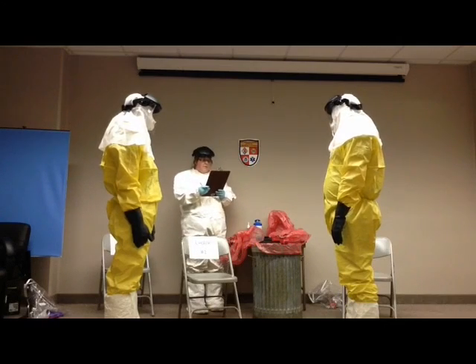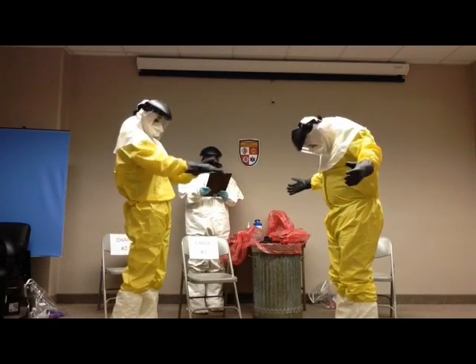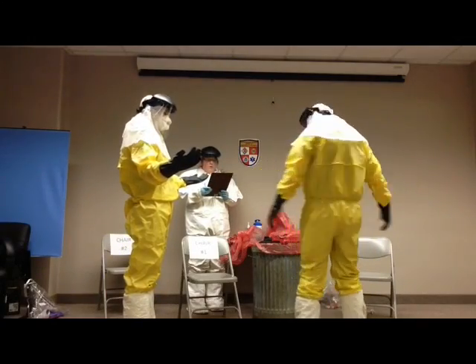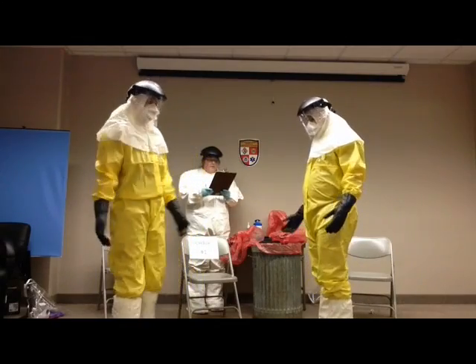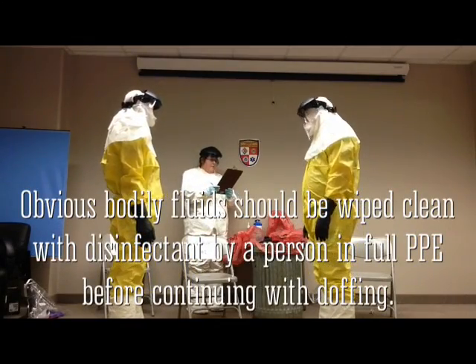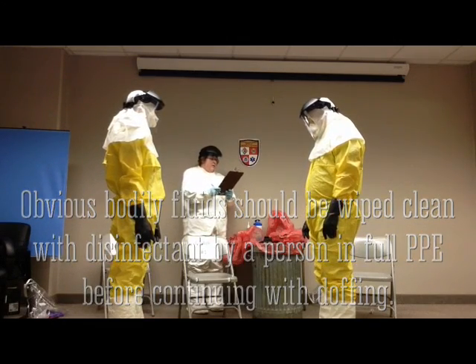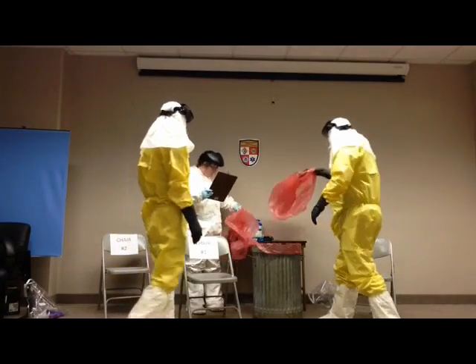Inspect PPE to assess for visible contamination, cuts or tears. Consider disinfecting the entire coverall with disinfectant wipe or spray, regardless of visible contamination. If there is visible contamination, then disinfect using the disinfectant wipe or spray. Allow for proper contact times. Stand in large red bag. Both feet should be inside the bag.